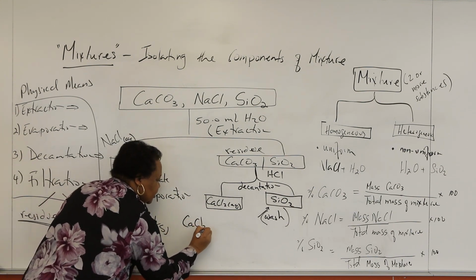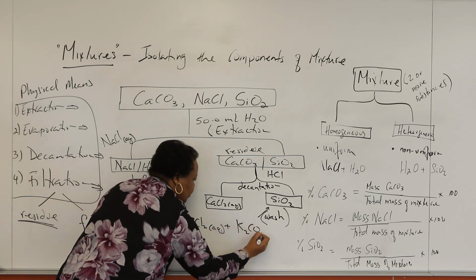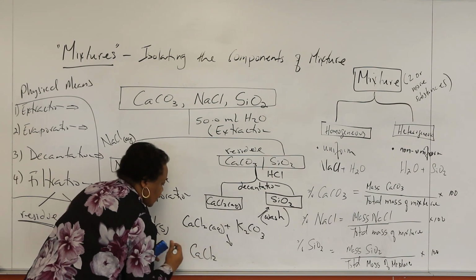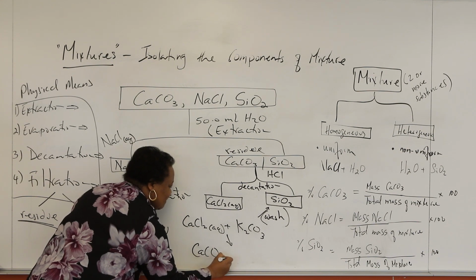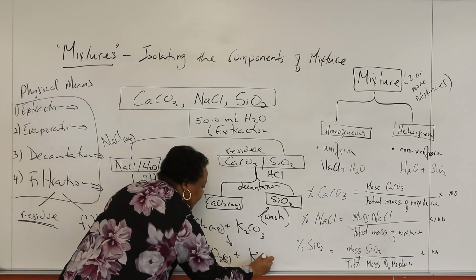So I'm going to take my calcium chloride solution. We're going to add potassium carbonate to that. And this will regenerate back, of course, please note, calcium carbonate. It's going to regenerate back my solid calcium carbonate and, of course, right, KCl.